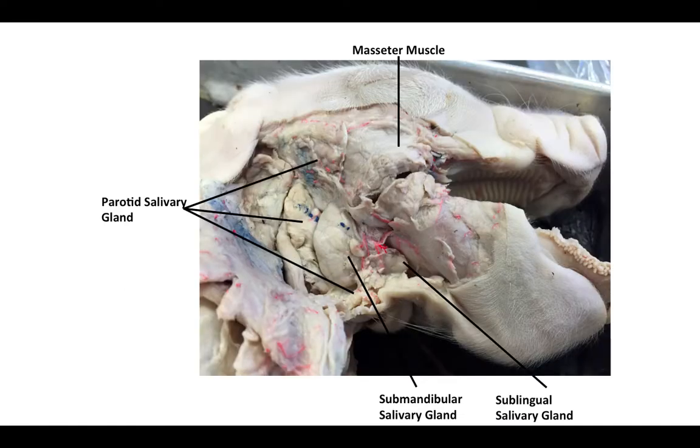Hello anatomists, this is your video to prep you for the fetal pig digestive and respiratory systems. First we'll tackle the digestive system.